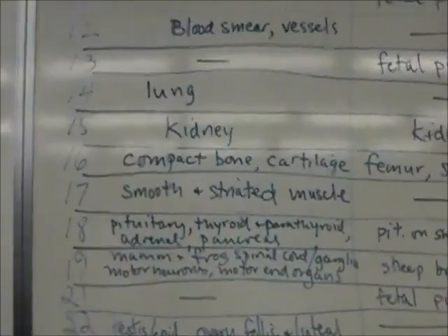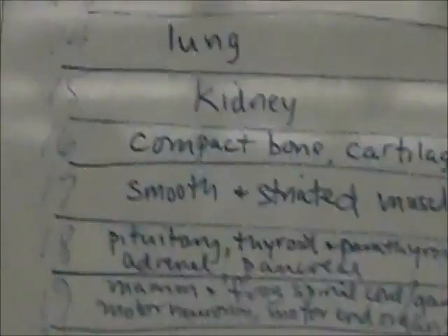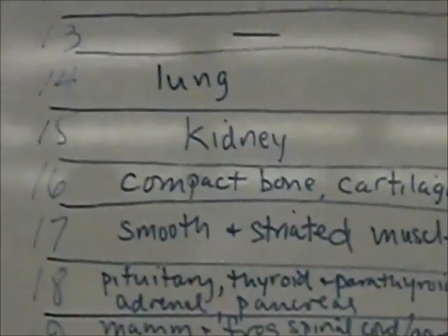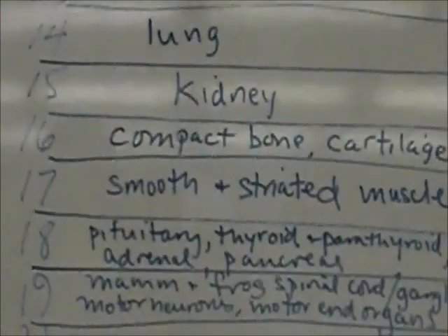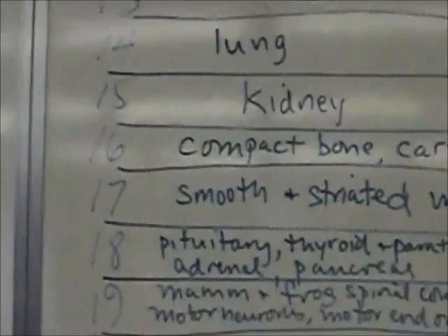So that was lung. Next we have kidney. Let me see if I can find myself a kidney. Let's see. Can I upload? Kidney is on the Dropbox?